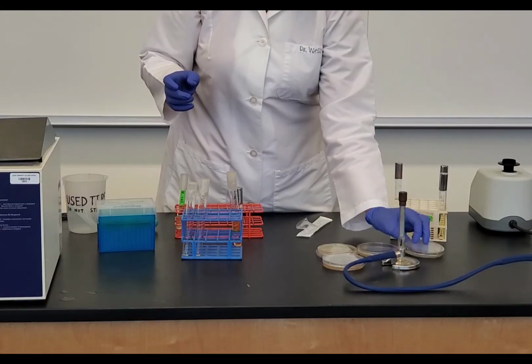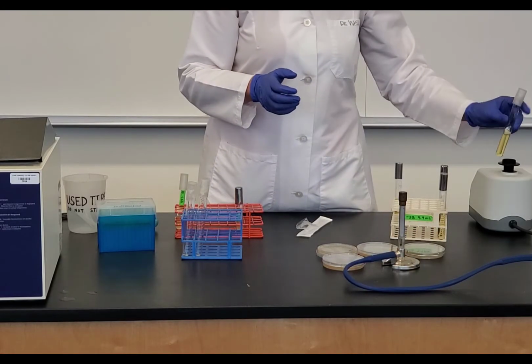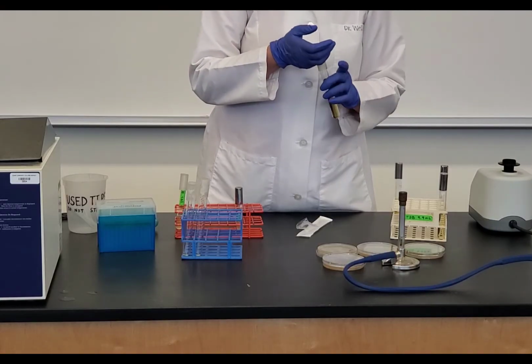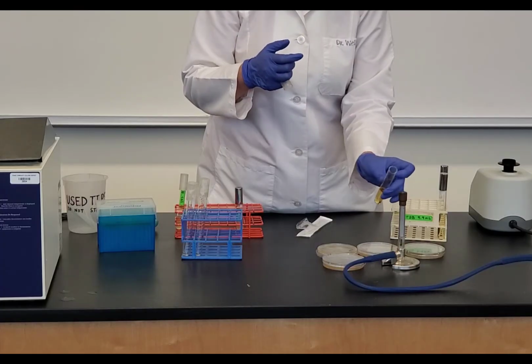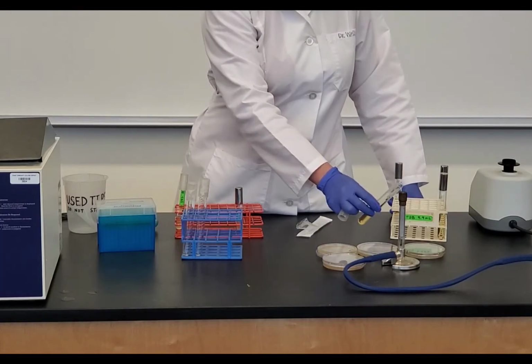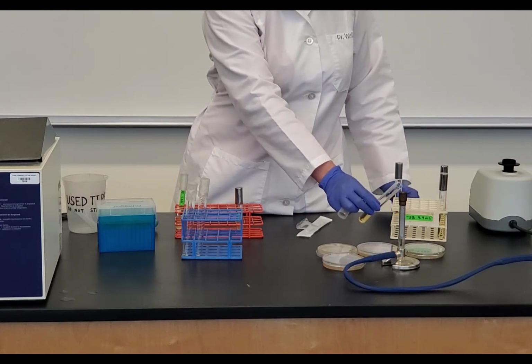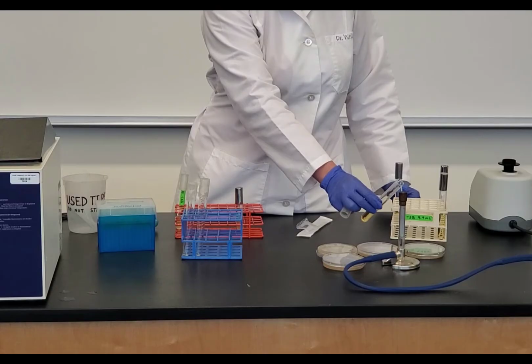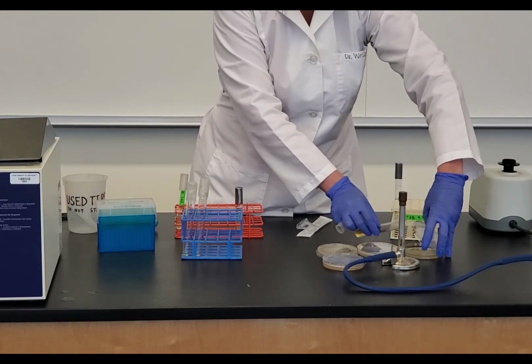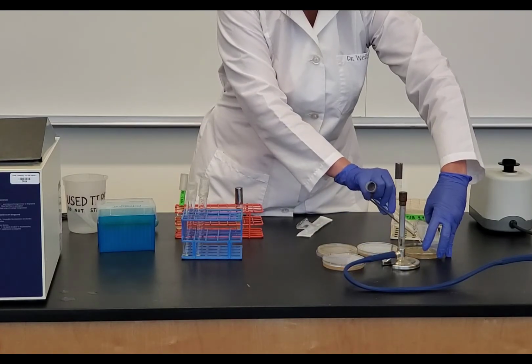Now I'm ready to pour it on my 10 to the negative 4. So I turn it over. I'm going to vortex this to mix it gently. And then I'm going to flame this. And I'm going to let it cool before pouring it. But when I'm letting it cool, I want to keep it close to the flame because that's my sterile area. So once I let it cool, I'm going to open my plate. And I'm going to pour the agar on top of the agar that's already in there.